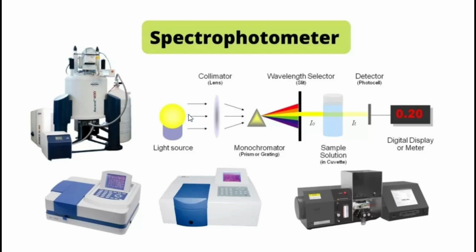So, delving into the spectrophotometer. So, in the laboratory po, we are using different kinds of spectrophotometer from the semi-automated ones to the fully automated po na mga spectrophotometer. But commonly, most of them po, either the semi-automated or the fully automated machines po, they follow the same principle and they have their own parts of the spectrophotometer which they follow. So yan po, it can be like this, na maliliit lang, parang box lang.